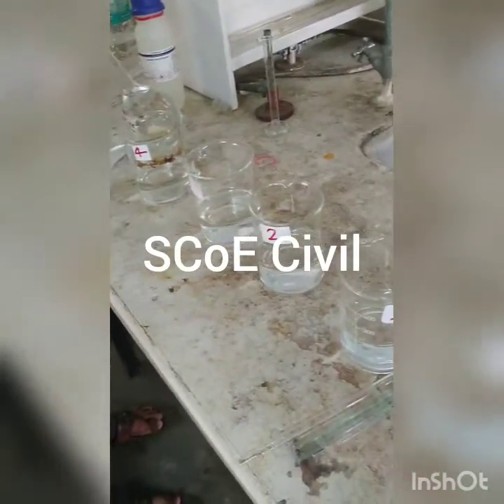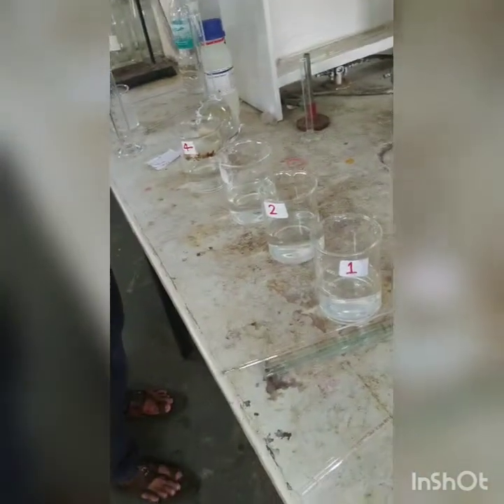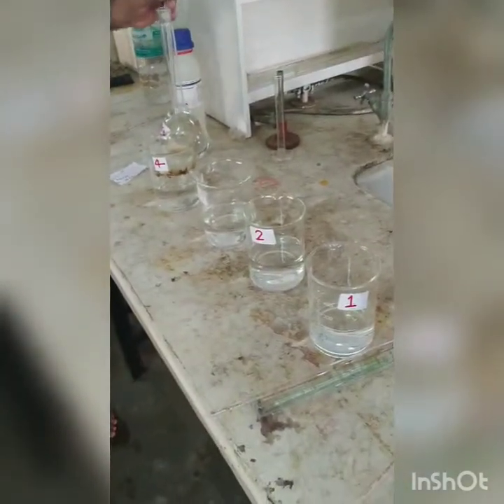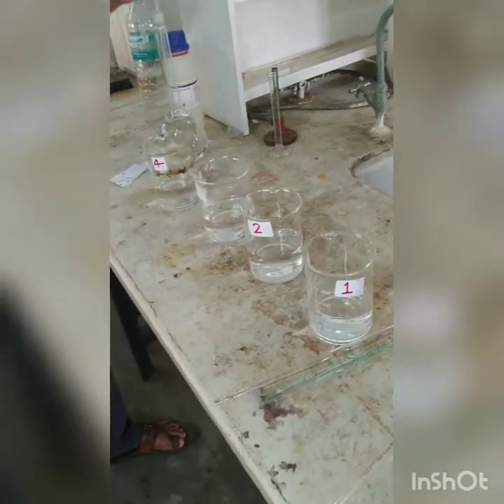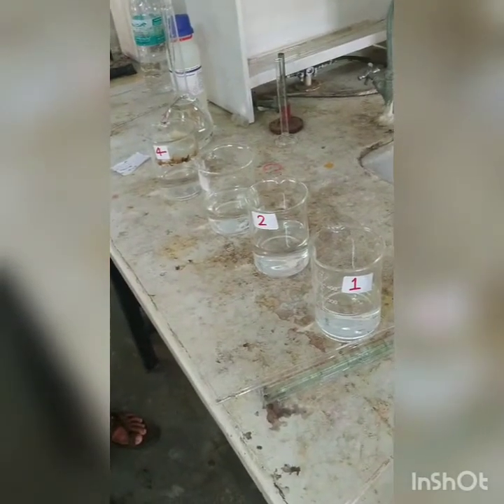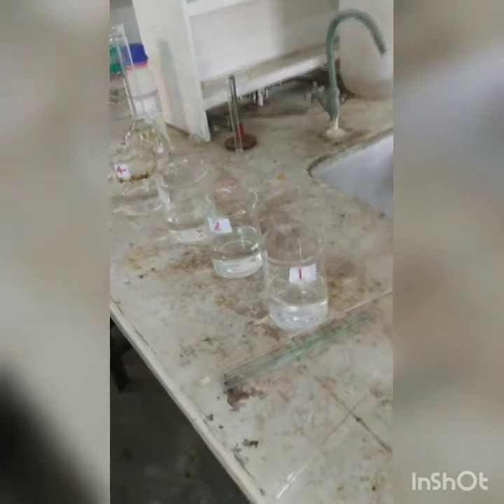Now, where have these dosages come from? These dosages come from the standard practice at the water treatment plant. At the water treatment plant, we normally find that these dosages are in the range somewhere between 1 to 1.5 mg per liter. This dosage should give us a residual chlorine of 0.2 mg per liter at the consumer end. So when the corporation or municipal council or Gram Panchayat's water comes to the water tap in our house, it should contain 0.2 mg per liter of chlorine.